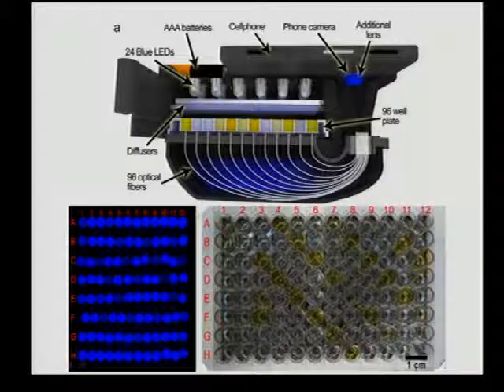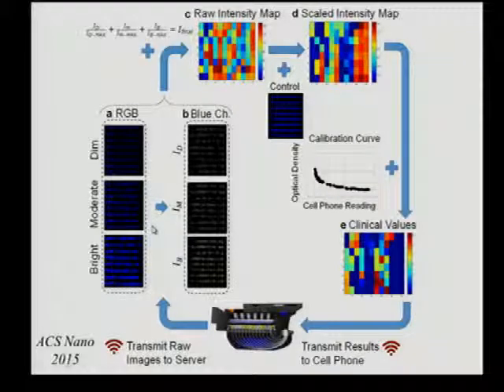The idea here is that by assigning each well to a multimode fiber, you can look at the transmission intensity, and the fiber bundle here reduces so that a simple optical interface can image the entire 96 well plate. And then we do machine learning on this and understand the concentration of each well corresponding to each fiber optic cable. This one is done off the server.